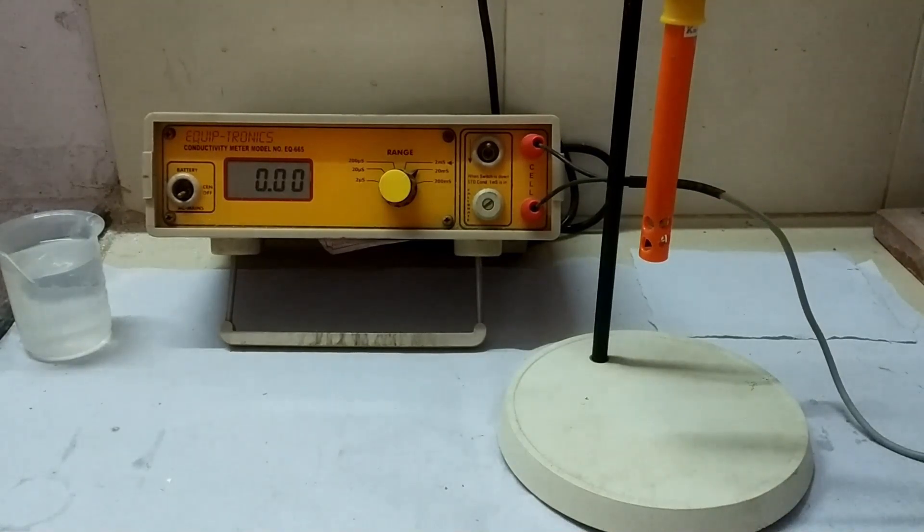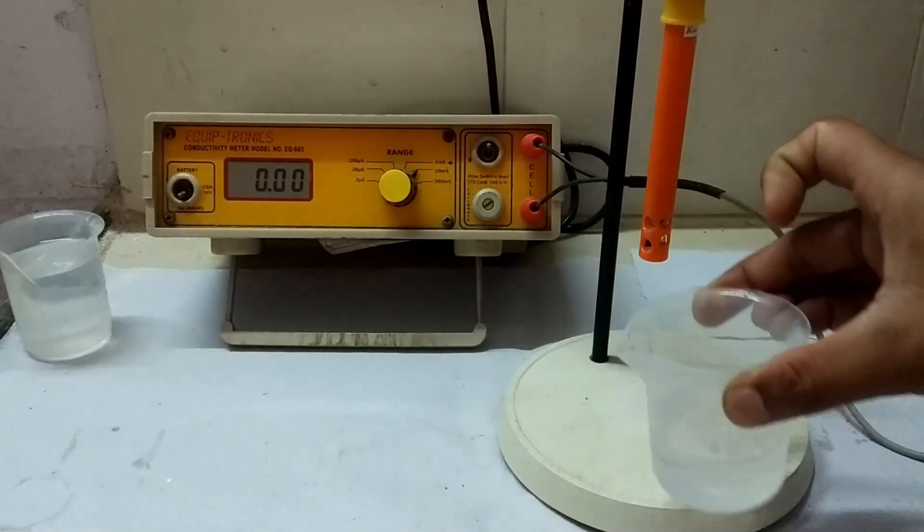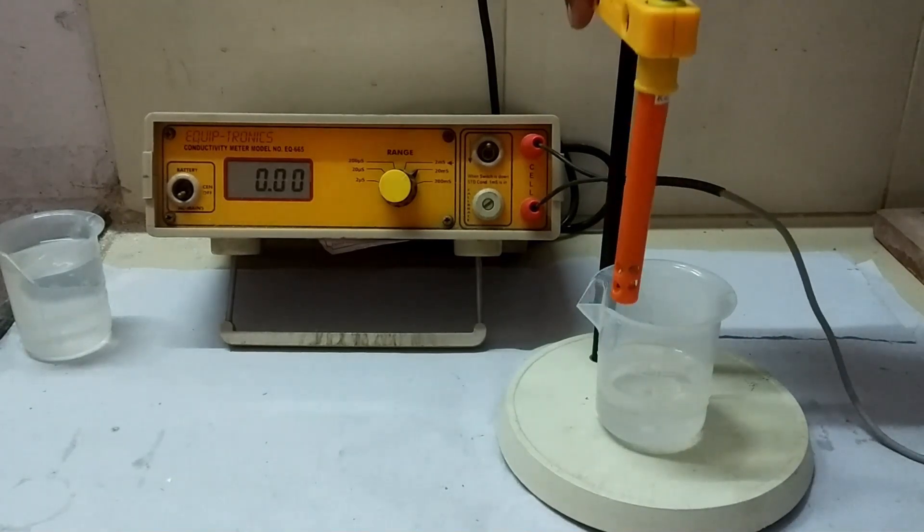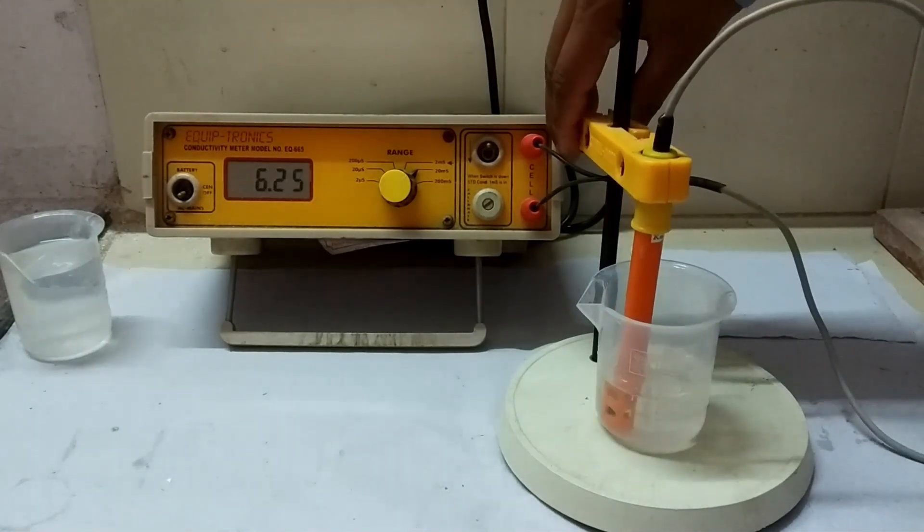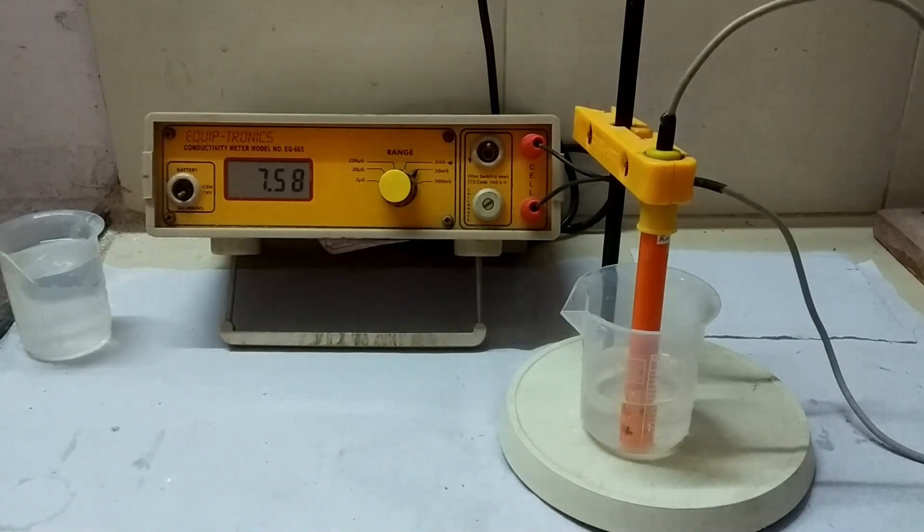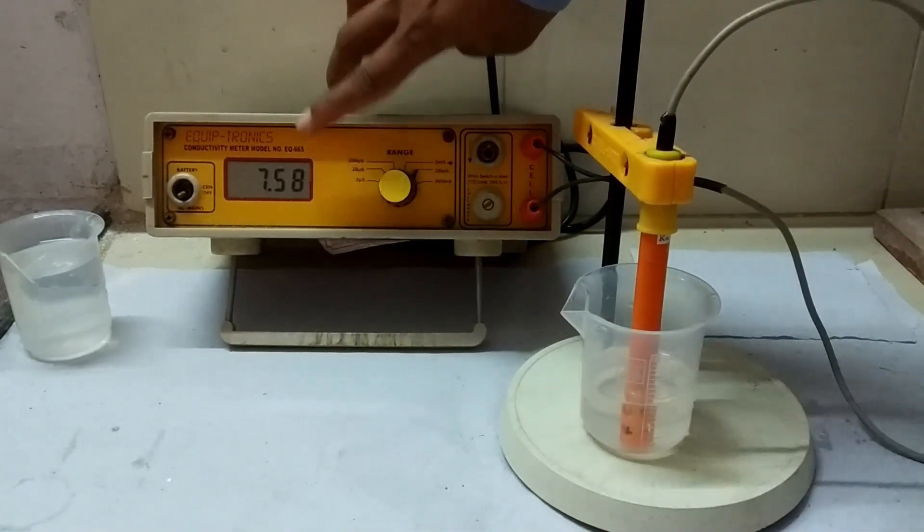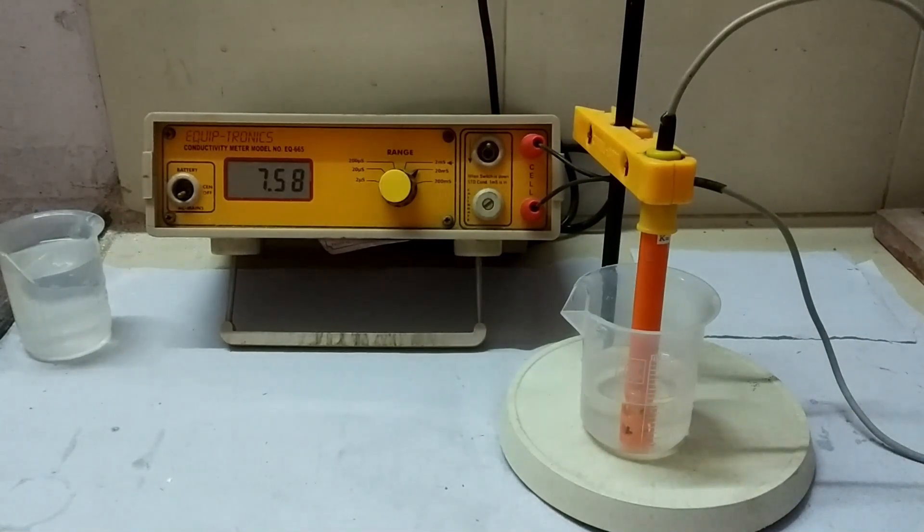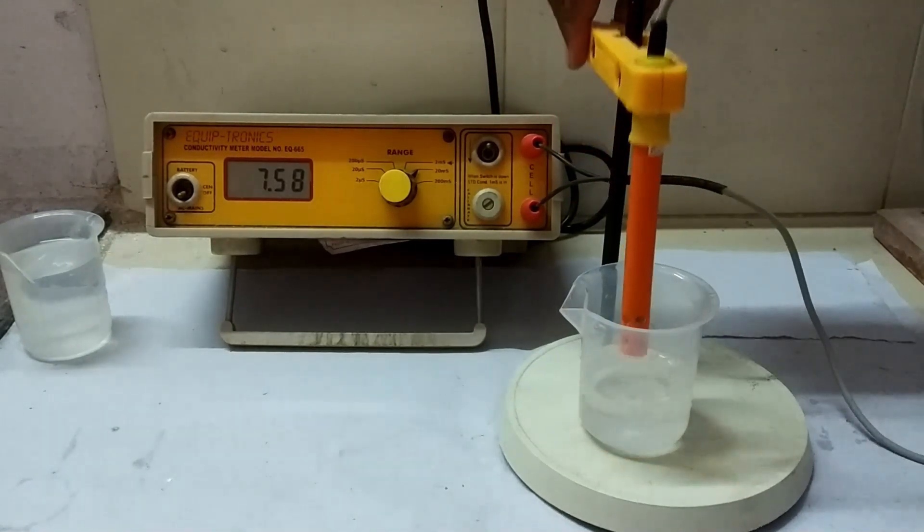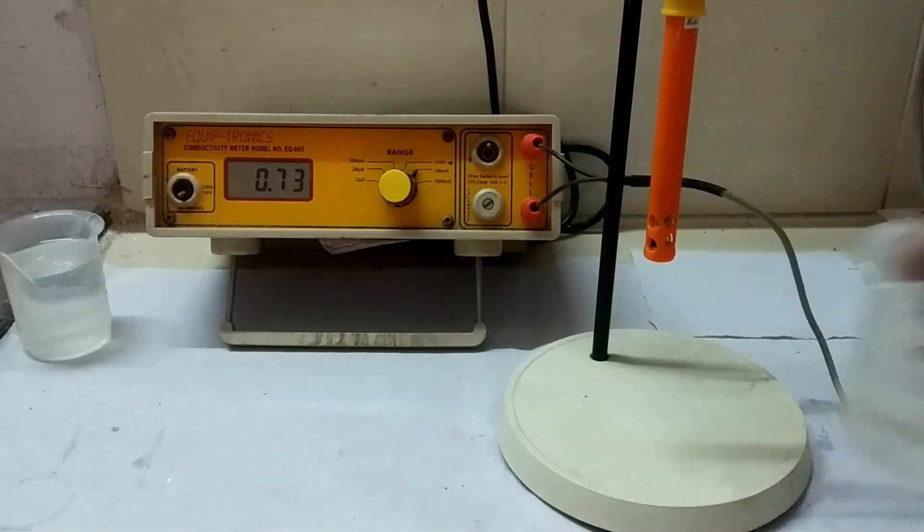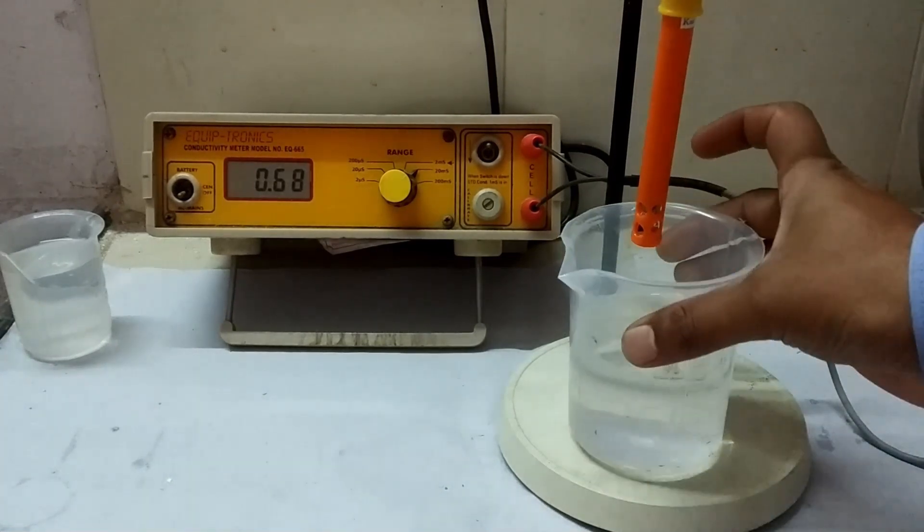Take the solution of unknown conductance. Dip the conductivity cell into this solution. The display shows conductance of the solution in millisiemens. Note down the conductance reading. Remove the conductivity cell and clean it again with conductivity water after completion of conductance measurement.